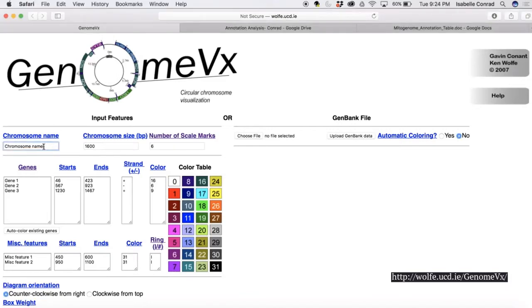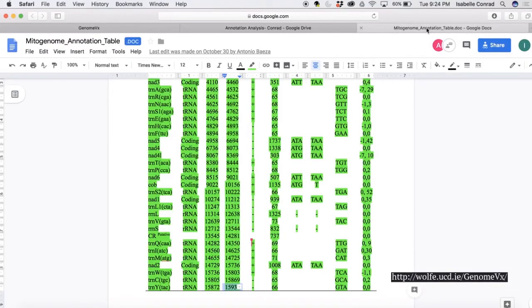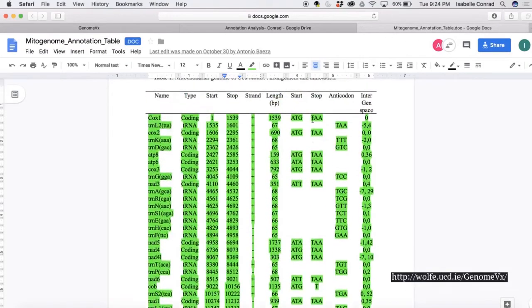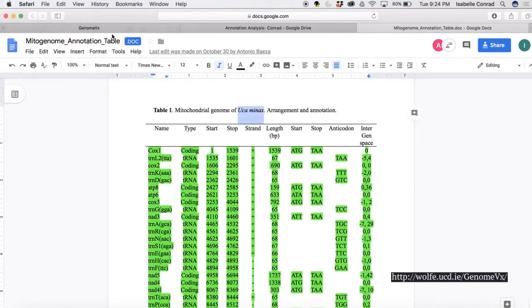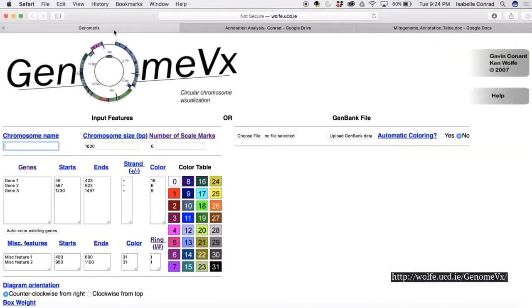We are first going to enter the chromosome name. We're just going to use the species that we are studying right now, so that would be UCA-Minax. We're just going to put that name into the chromosome name bar.